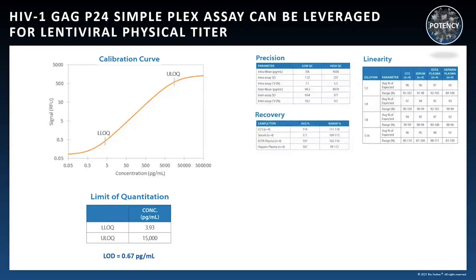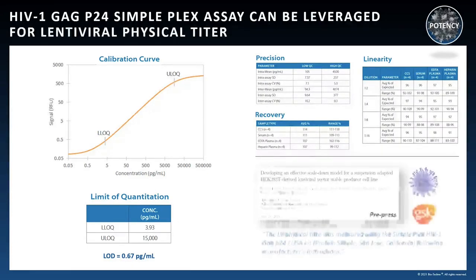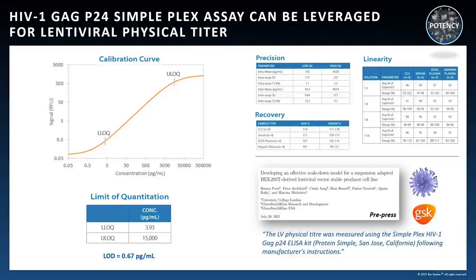Now, the assay performance shown here clearly doesn't spell out lentivirus work, but we know it's being used in that way. In fact, shown here is a pre-press article from GSK where they're using this very assay for lentivirus titer according to the manufacturer's instructions.